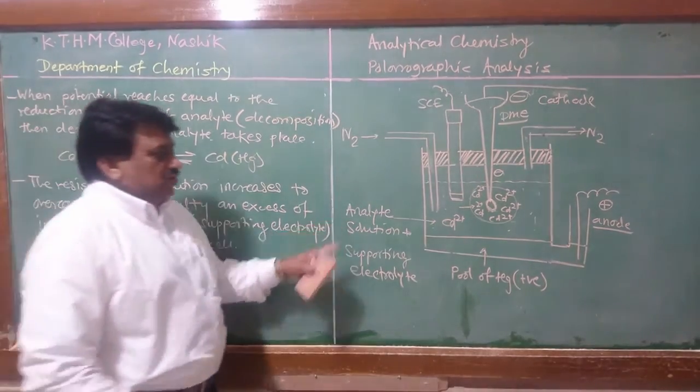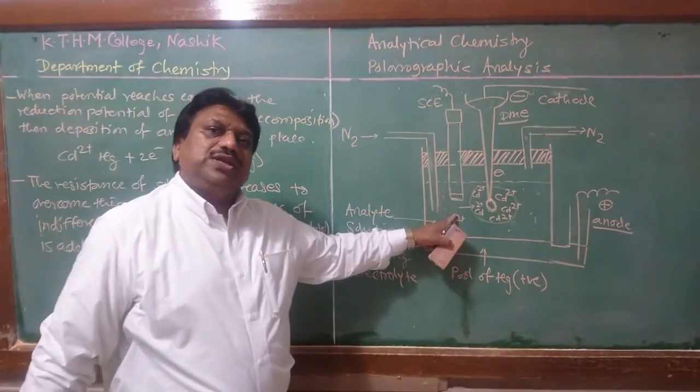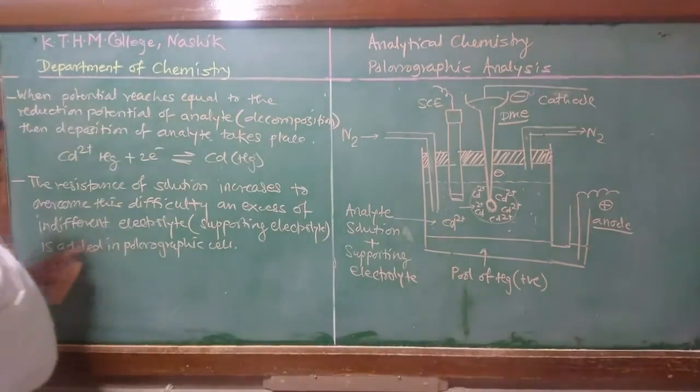Therefore, the analyte solution plus supporting electrolyte is taken into the polarographic cell.